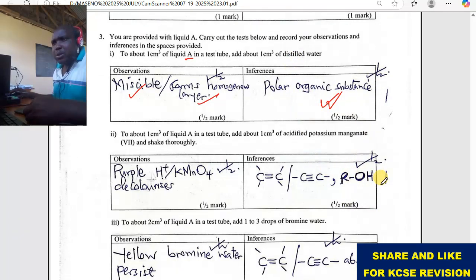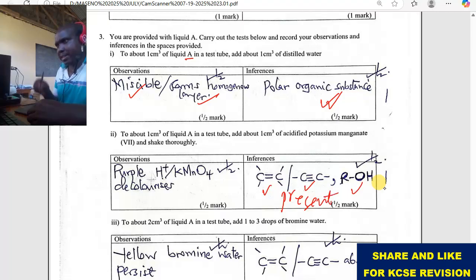To about 1 centimeter cube of A, add acidified potassium manganate. Manganate is purple in color. If the color changes to colorless, if acidified potassium manganate is decolorized, then it means the alkene, the alkynes, and the alcohol are present. So these three are suspected to be present.